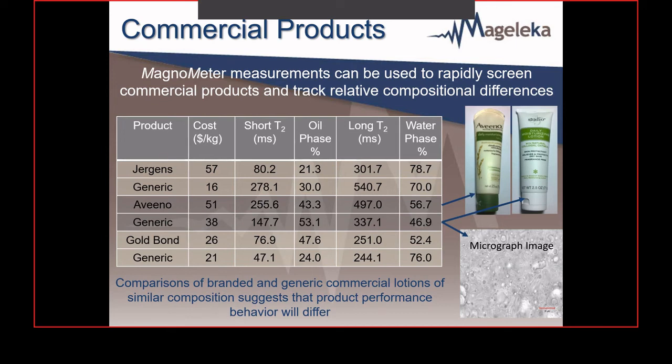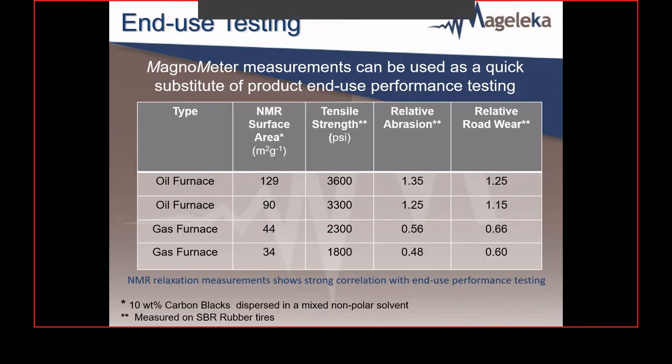So this is a material that you can get into an NMR tube. But what about a material that you can't get into an NMR tube? Well, one of them would be a piece of automobile tire. In the tire industry, carbon black is added to rubber to enhance the compound's physical properties. Carbon black is non-spherical, and determination of surface area from size and distribution is difficult, since dispersions are inevitably comprised of aggregates and conglomerates. But the surface activity of carbon black has a great influence on the reinforcing properties in tire making. In the industry, they call it surface activity.